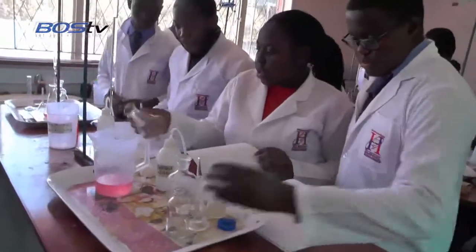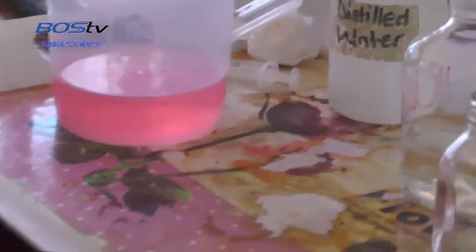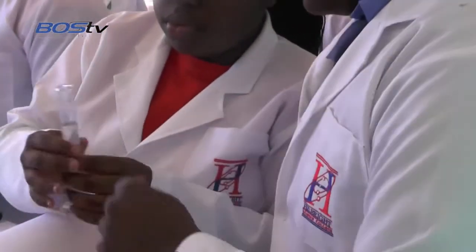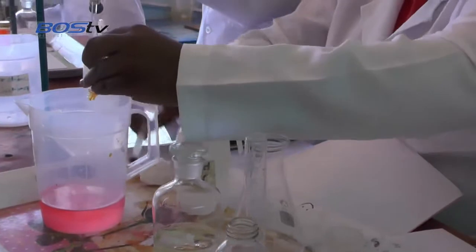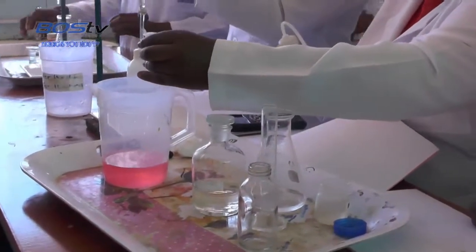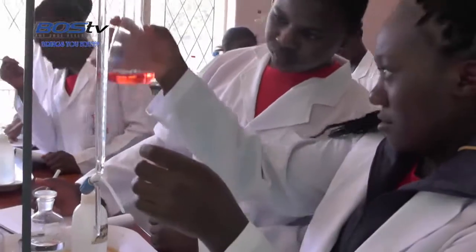Your second endpoint is the appearance of a pink or orange color. That's your second endpoint after adding methyl orange. So the students achieve that color and stop the second time.